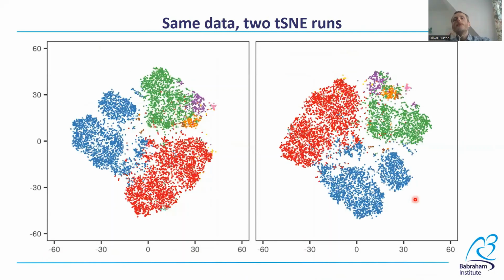What does this mean? Well, if we generate two tSNE distributions of the same original data, they will look quite different due to random initialization. You can see that the colored clusters in these two examples running off of different initializations look about the same, but they're in different places. These are the same cells in both examples. They're rotated around and shuffled, so nothing's in the same place. Nothing has the same coordinates.